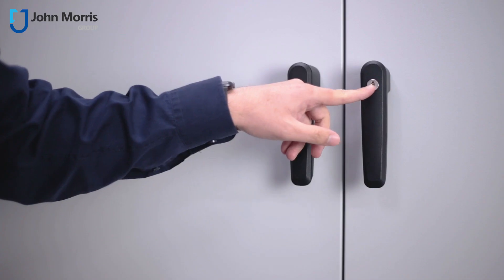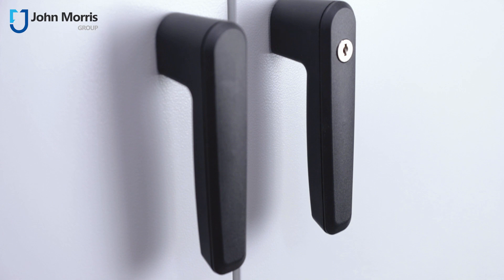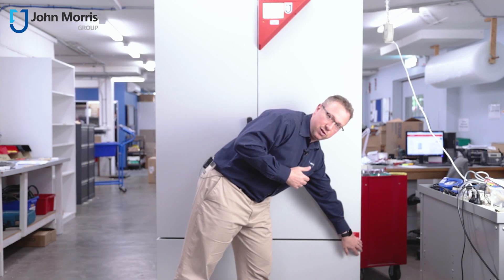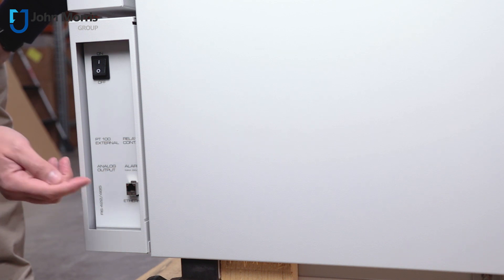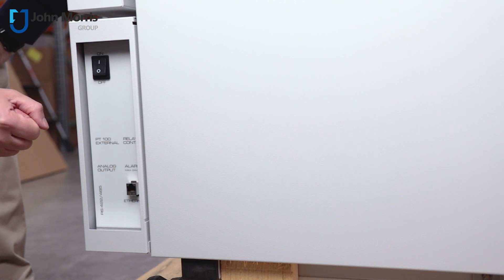On this particular unit, we also have the locking feature for added security for your samples. And down here, we have a range of connectivity options for the different requirements of your facility. In this case, the customer has asked for the ethernet option, but as you can see, there's also RS-422, RS-485, analog output, and a range of other connectivity options.